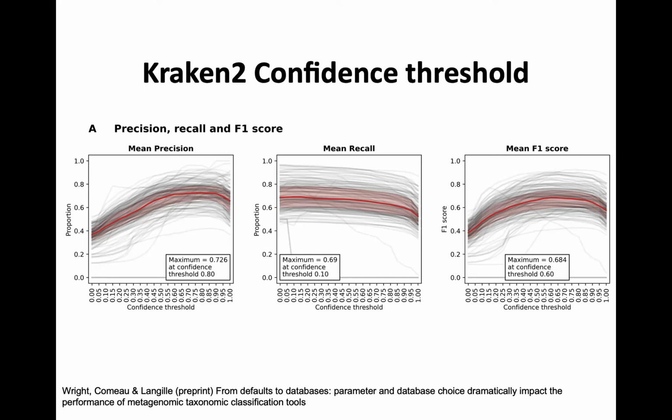And the reason is that if we think about a database saturating, for human microbes, if you looked at our rarefaction curve of how many new species we get if we sequence more, we're plateauing there with the human microbiome. And with environmental soil samples, it's still going way up. So we're not plateauing.